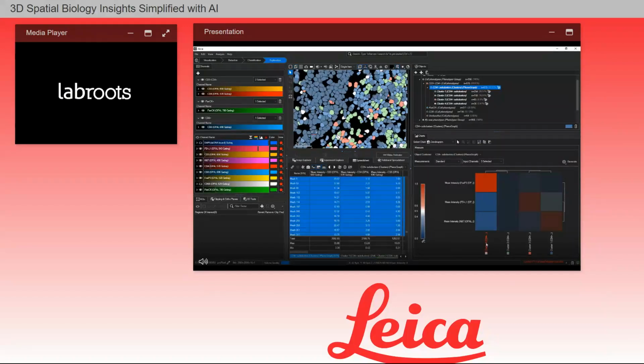If I click on the column header, you can see the column on the dendrogram gets highlighted, along with all of the mesh objects on my image. And I can switch between different columns by clicking on the header. I can do the same for rows as well.